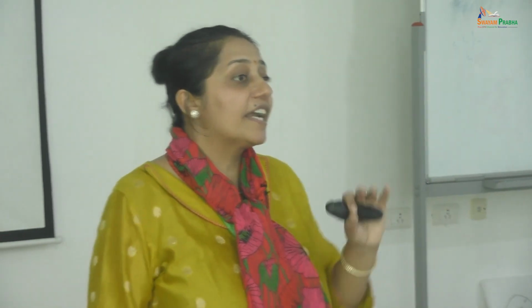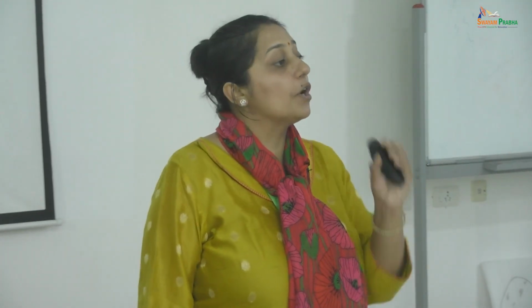So if it is completely non-growth associated, ideally you should be thinking about two-stage cultivation, because ultimately productivity matters. In the first stage, you should implement all the strategies which can improve your biomass, and then switch to conditions which will improve your product inside the biomass.